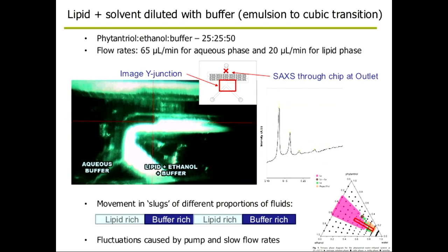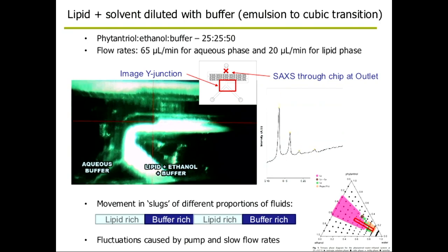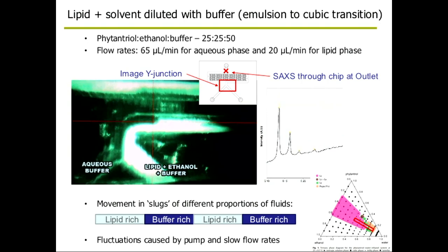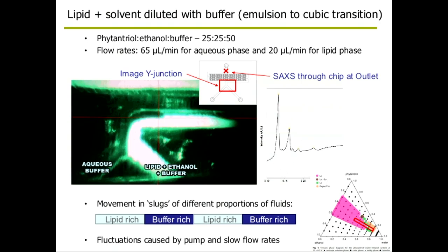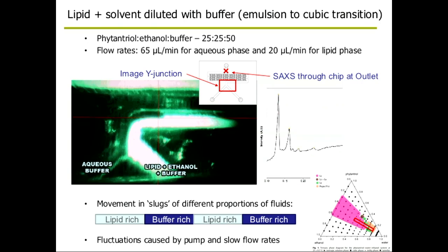So from a phase behaviour perspective, for those that are used to looking at these sort of phase diagrams, I don't know, is this your one, Johan? Due to ethanol phytantriol water? No? Just propylene glycol phytantriol water.